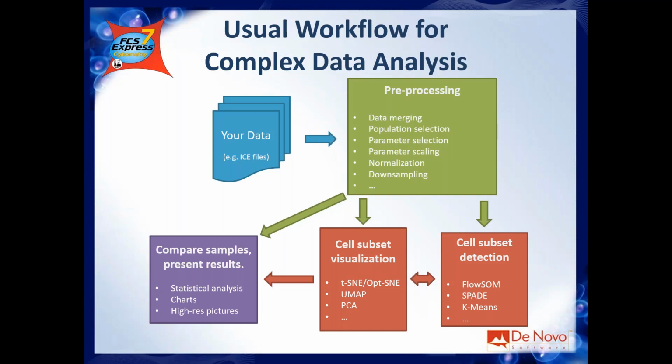But still, downsampling is one of the pre-processing steps. I will show you an example of downsampling that might be useful. So this is the pre-processing part of the analysis. It's anyway a pipeline itself, because you are filtering some parameters, you are filtering some cells. Eventually, you are normalizing, and then you are scaling and whatever.